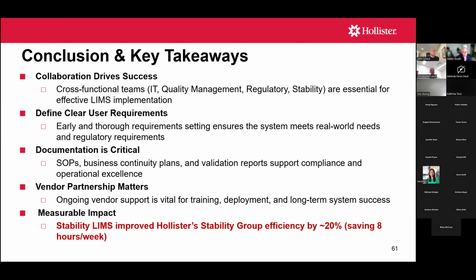Again, choose your vendor wisely. It's important. I mean, this is an investment. This is certainly not as much as an ERP system like SAP, but you're talking $100,000 on up, depending on the number of users. Licensing from different vendors is different. It could be by concurrent users in the system, or they may require each user of the system to have an individual license.